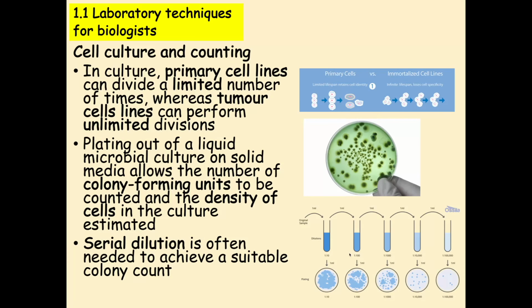Sometimes, however, that plate will be absolutely overwhelmed with microbes, and the only way for us to get a suitable cell count is to go through a series of serial dilutions.